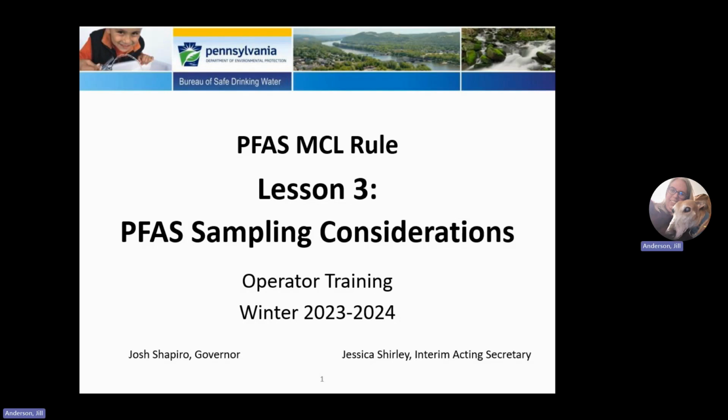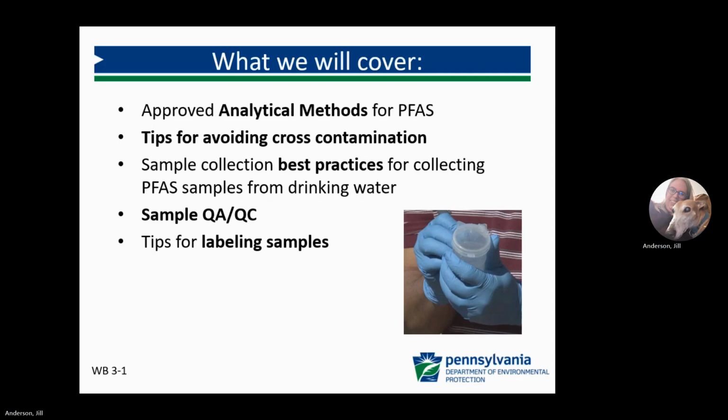Welcome to this recording of the PFAS MCL Rule Public Water Supplier and Operator Training. This recording will cover Lesson 3 and will provide sampling tips and considerations for avoiding cross-contamination. In this lesson, we will cover approved analytical methods for PFAS, tips to avoid cross-contamination during sampling, best practices for collecting PFAS samples from drinking water, sample QAQC, and tips for labeling samples.